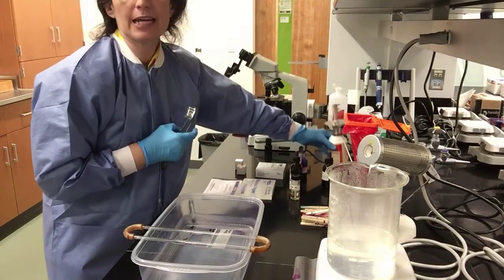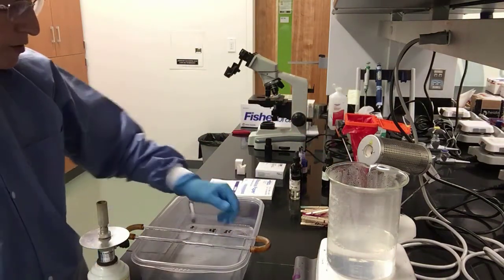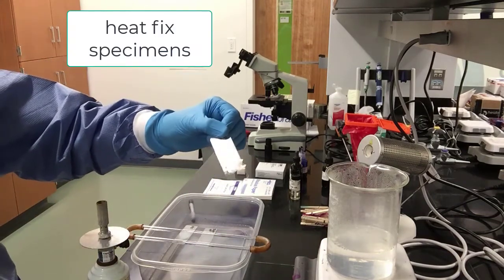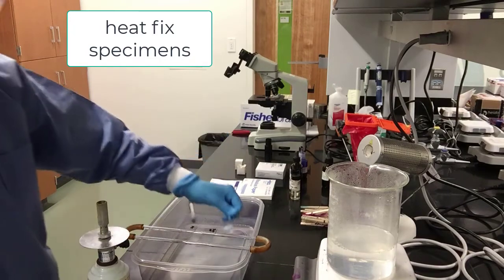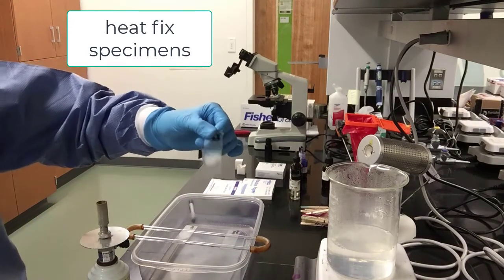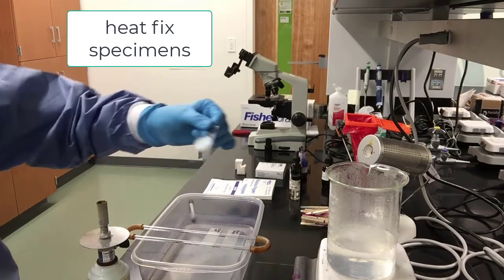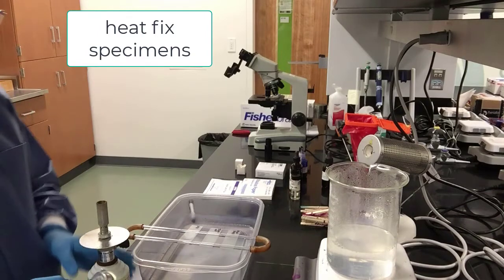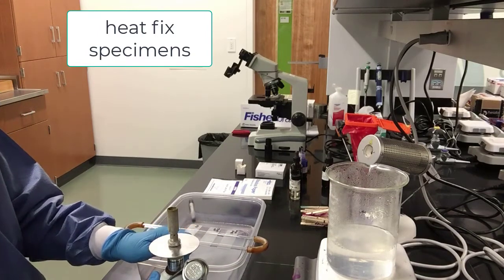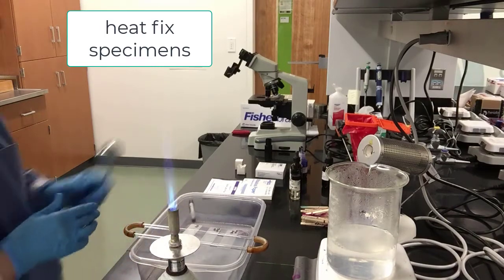So an easy way for us to, we forgot to heat fix, so I'm glad we're going to do that. We will pick up the slides. You can see they're nice smears after air drying. There's another one that's air dried. And our mix has air dried very nicely. But we need to heat fix. We cannot forget that stage because this will really help fix our bacteria onto the slide.